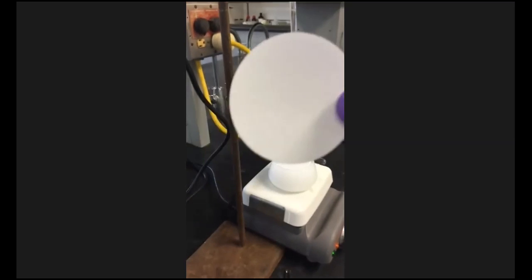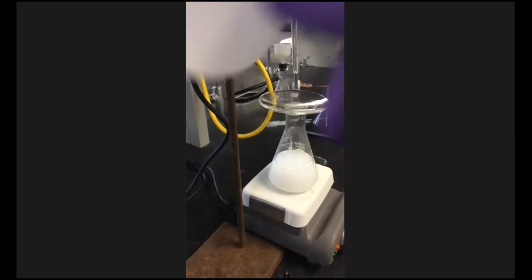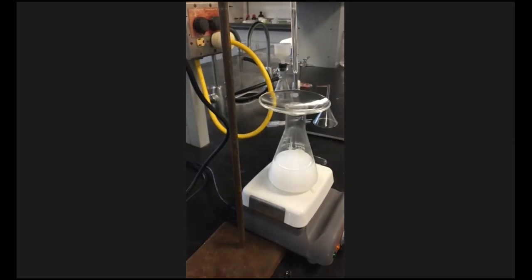I'm gonna show you all of that. So I'm gonna go ahead and weigh this, and I'll tell you what the mass is so you can write it down. So the mass of the filter paper is 0.18 grams. .18 grams.